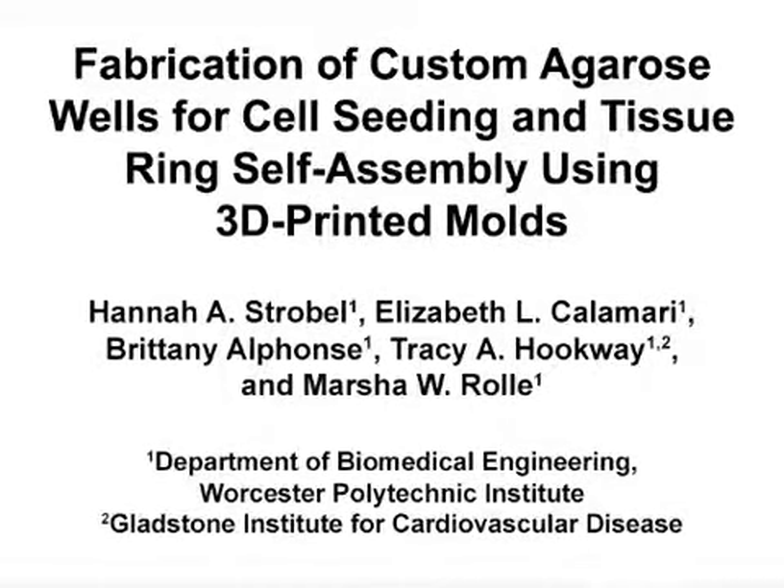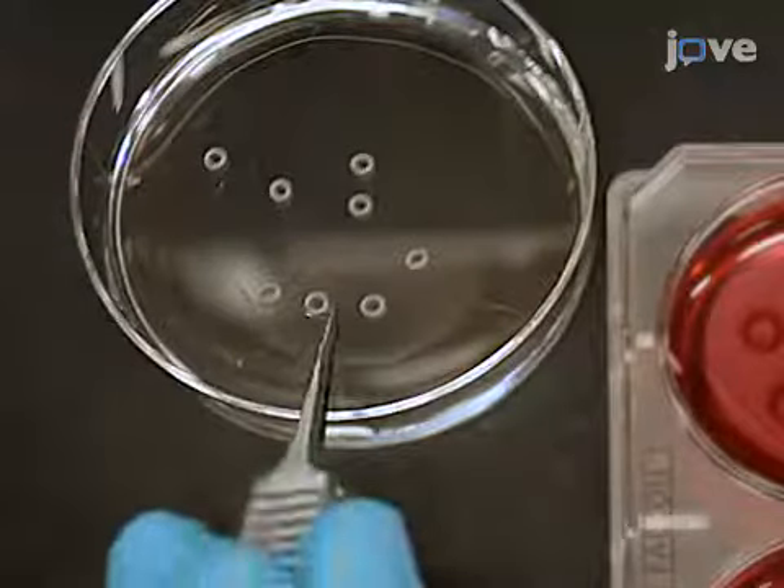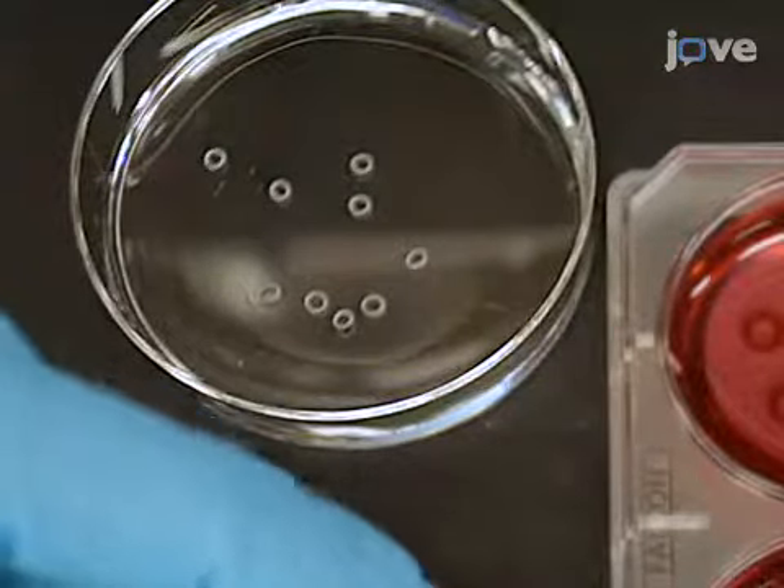The overall goal of this procedure is to create custom cell seeding molds that are used to make self-assembled tissue rings of various dimensions. This method allows us to create three-dimensional tissue rings from human cells that can be used to evaluate tissue structure, strength, and function. The primary advantage of this technique is that it is a simple method for fabricating molds for self-assembled tissues with custom dimensions.